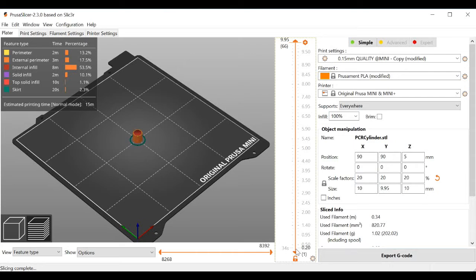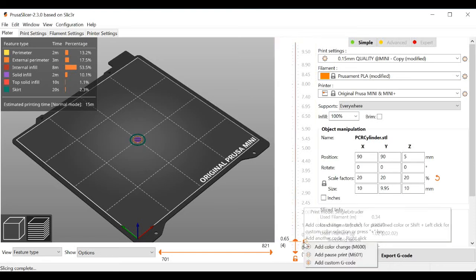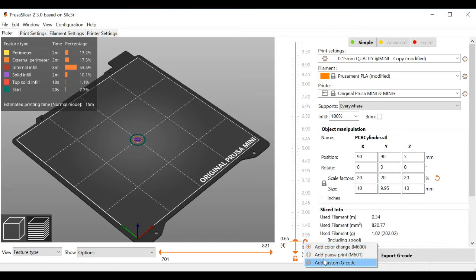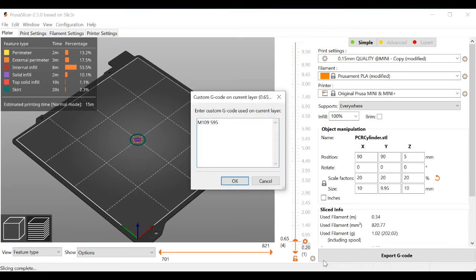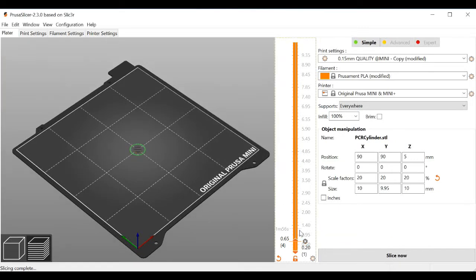The code that you need to enter is M109, which tells the printer to set a temperature for the hotend and wait for the temperature to be reached before proceeding. This code is followed by R and the temperature that you want to set. It's important to use R instead of S in this case, since it forces the printer to wait while the hotend cools to the target temperature. S only pauses if the temperature is below the target temperature.